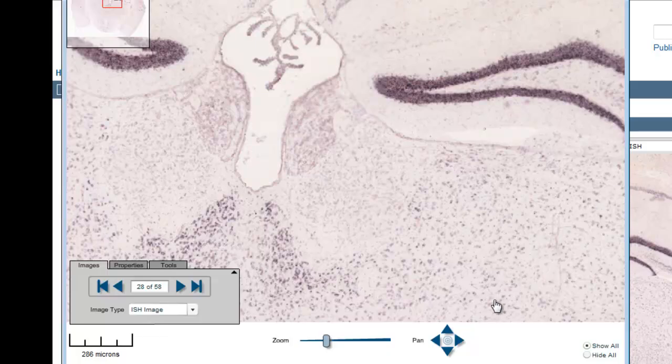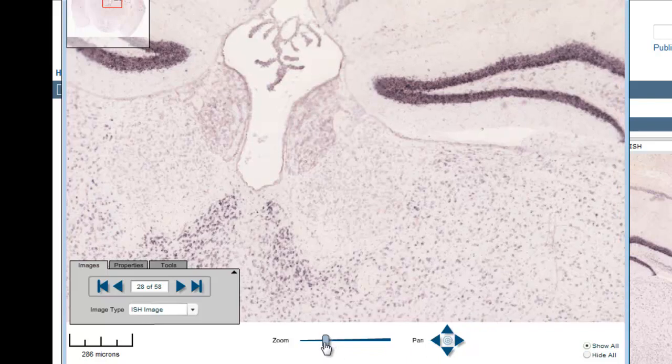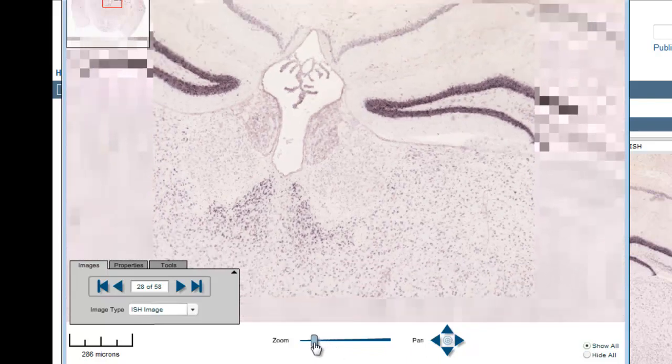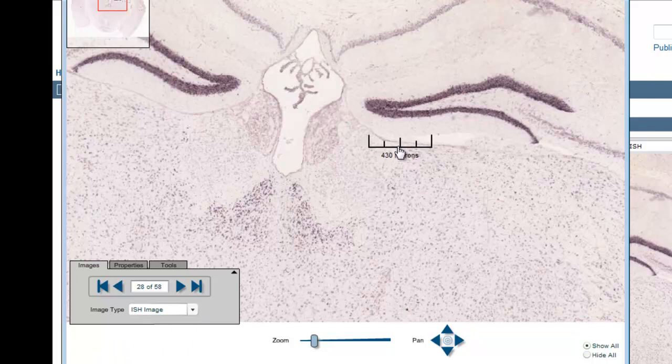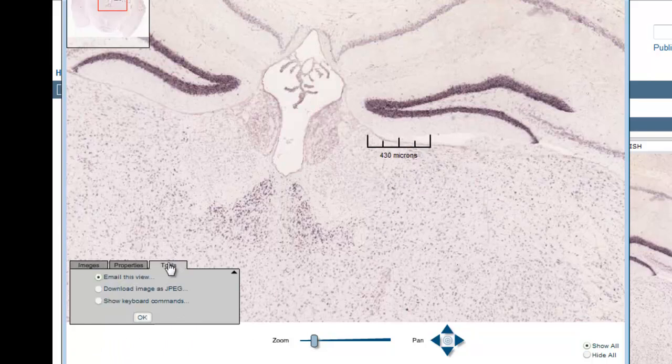In the high resolution image viewer, you can again pan and zoom the image. You can use the scale bar to measure distances in the image, and you can download the image as a JPEG file to your computer.